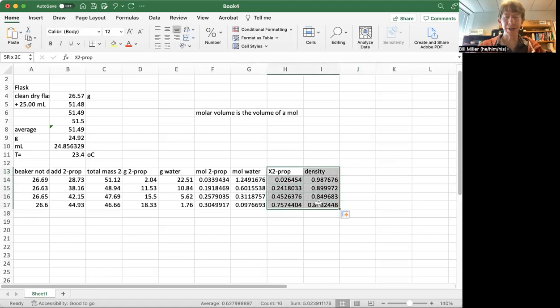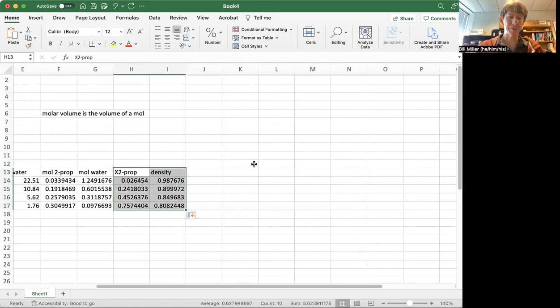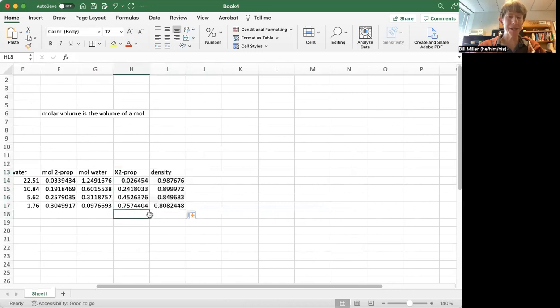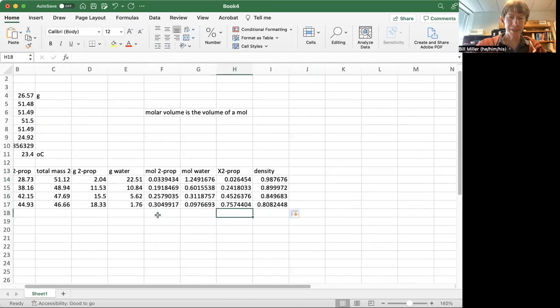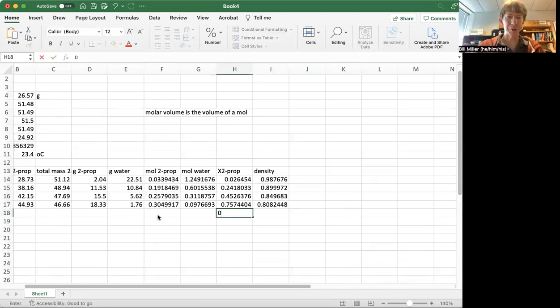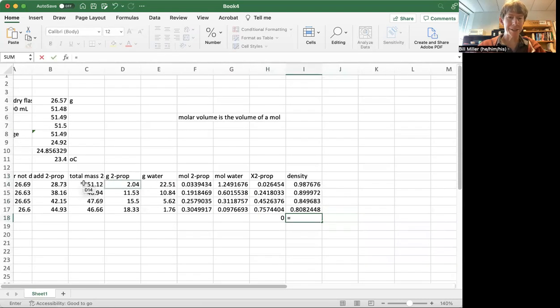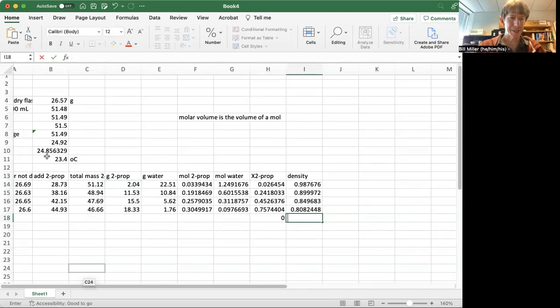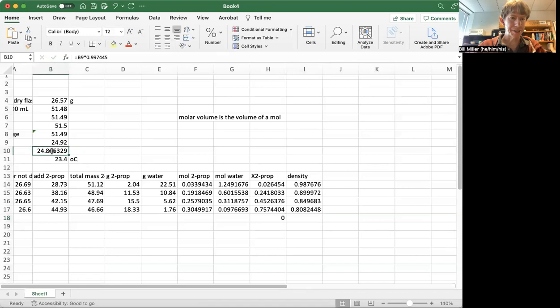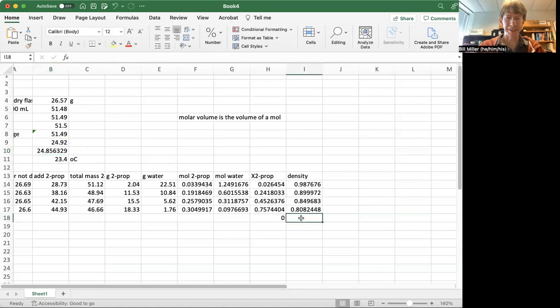So I'm now going to graph these four. I'm going to graph six points. I'm going to graph mole fraction of zero 2-propanol, which will be exactly the density of the water, which was, I put it in here, 0.997445. That's that number right here. So I'll copy and paste it.